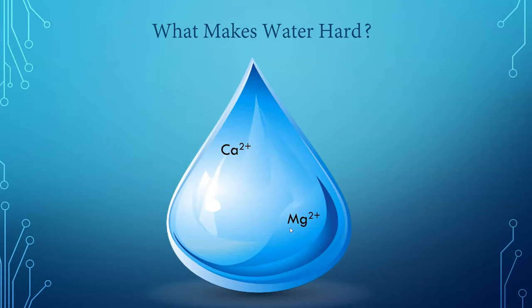Magnesium, being chemically very similar to calcium, also contributes to water hardness, and we'll talk in a couple of minutes what exactly we mean by that. There's other elements in water as well. We have potassium ions, there are sodium ions. Those are pretty harmless. We have some heavy metals like manganese, even chromium 6, which is not a very safe substance. If you've ever seen the movie Erin Brockovich, it was all about PG&E contaminating groundwater with chromium 6, which can be very dangerous in high concentrations.